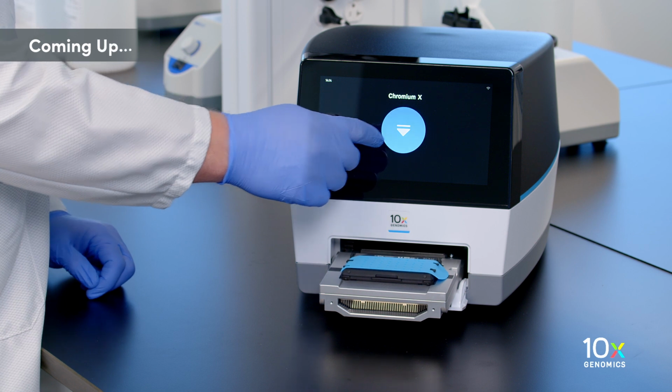We loaded the reagents into the chip. Next, we will load the chip into the Chromium X.